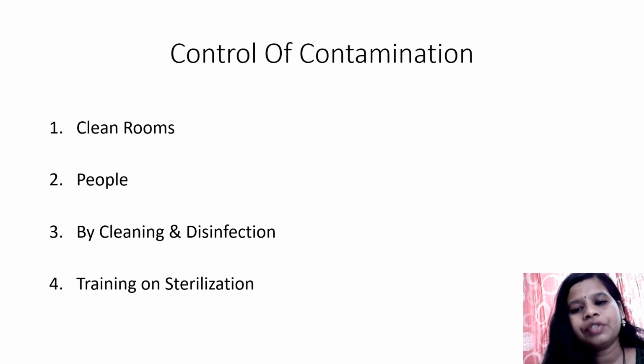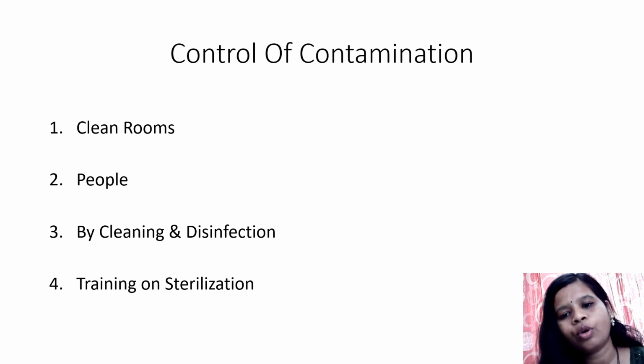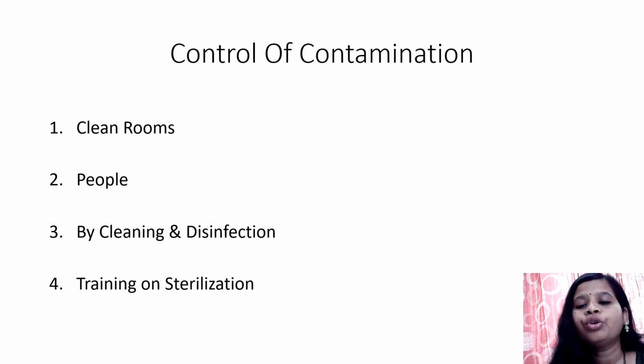Then if something unusual happens during this sterilization, it should be properly recorded what happened, how it happened, and what was the possible cause. If we know the cause, proper recording and proper documentation is required. As well, after sterilization, whatever things or products are there should not be mixed with the prior products.